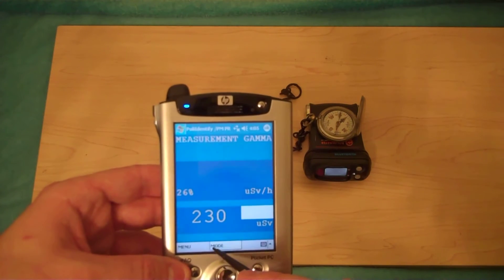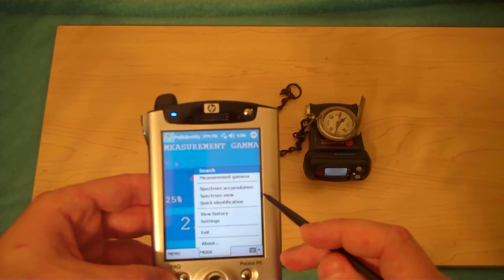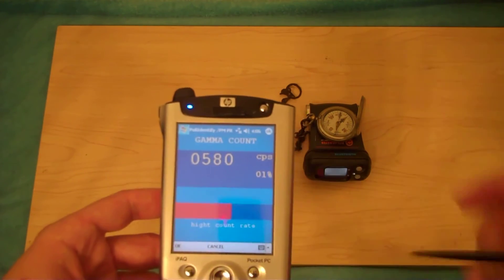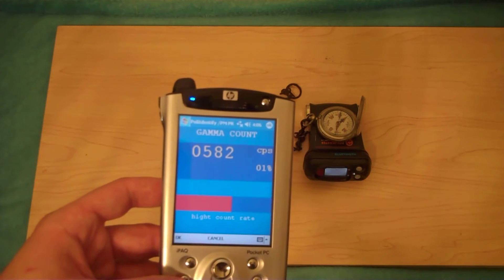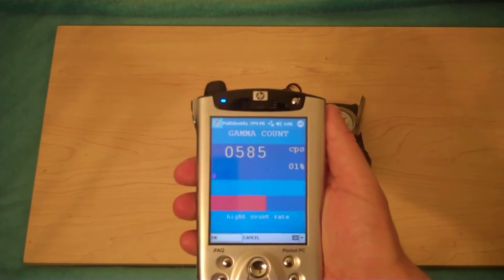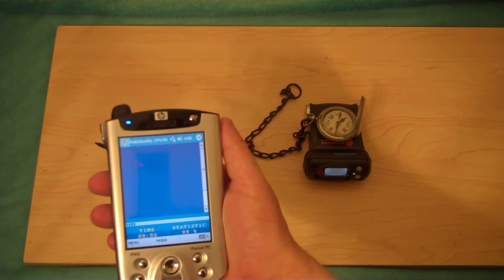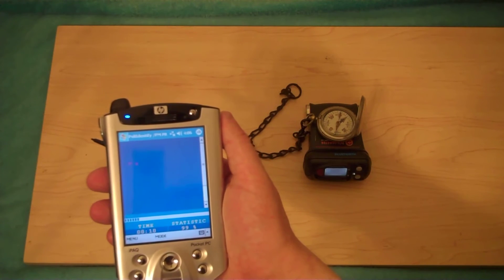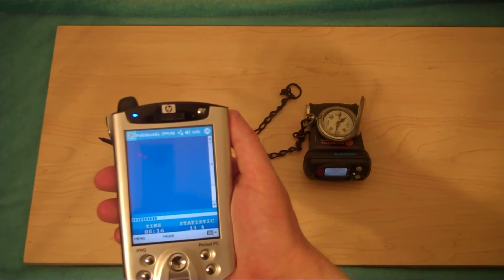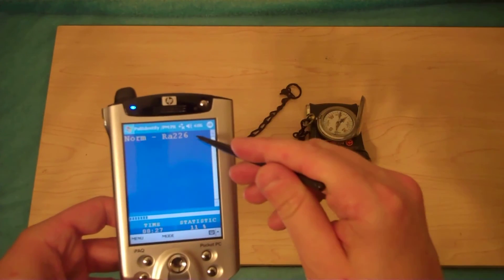Now that we know how hot it is, let's confirm what's in it. We could take a gamma spectrum, but we could have a lot more fun by just clicking the rapid identification feature. Now, this is warning us that our counts are a little high — it likes a lower count rate — but it's perfectly capable of working in very high count rates. Let's see what we get. This shouldn't take long with this much radiation. There we go: Radium-226, right on the dot. It identifies it as NORM, which is naturally occurring radioactive material.